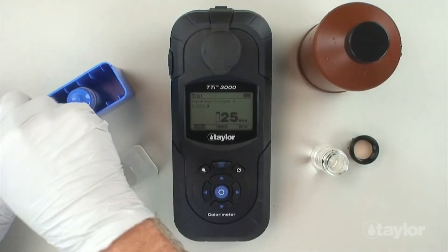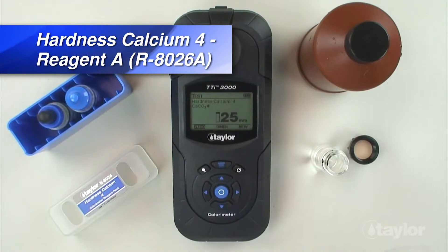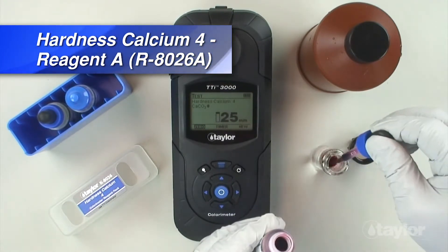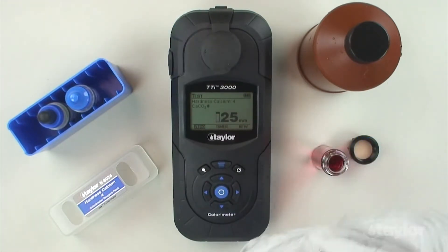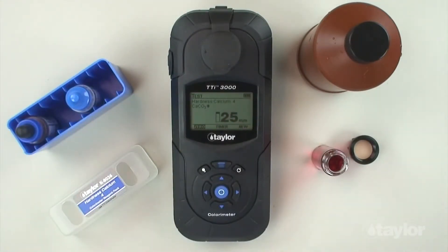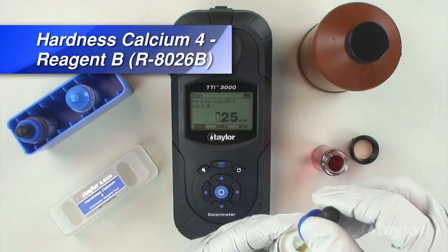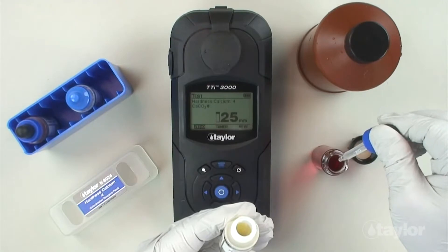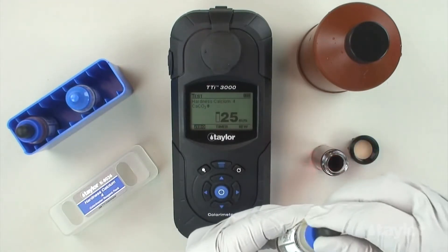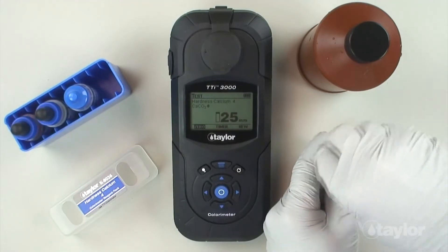Add 0.5-ml hardness calcium 4, reagent A. Add 0.5-ml hardness calcium 4, reagent B. Cap and swirl to mix.